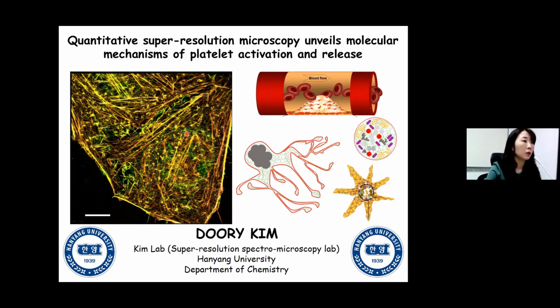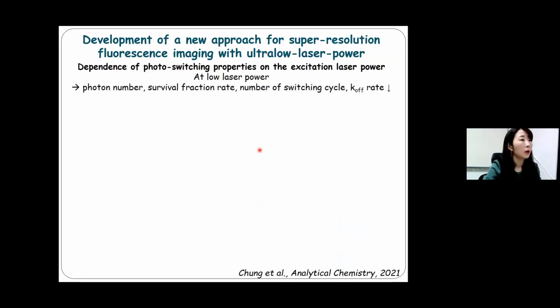So today I will present our recent work on the application of this technique to the small platelet. In particular, I will present super resolution imaging studies on the molecular mechanism of the platelet activation process and release process, respectively. Before we talk about our main story, which is the platelet, let me briefly introduce our recent work, which is about the development of a new approach for super resolution fluorescence imaging with ultra-low laser power.